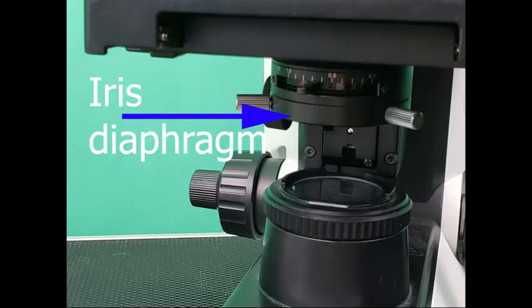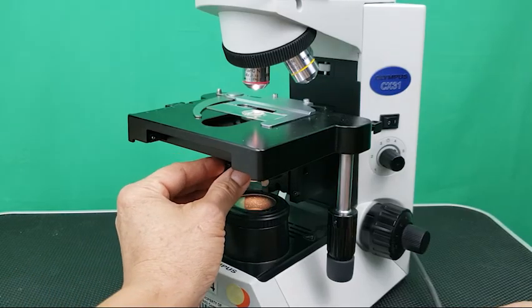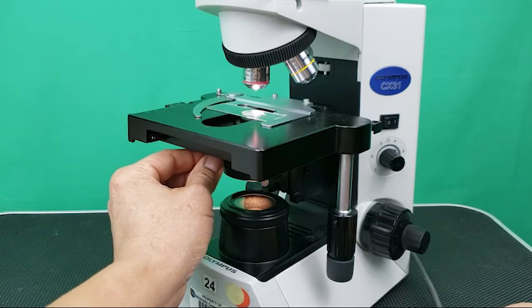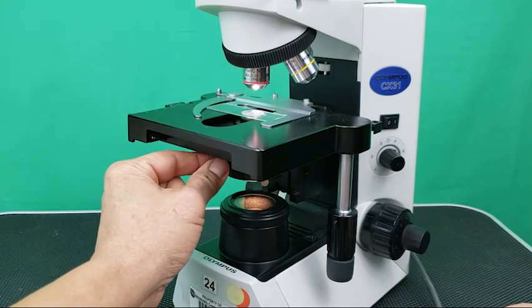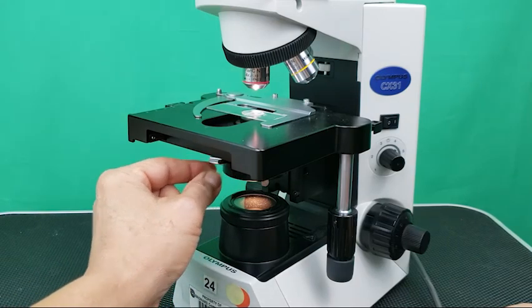Iris diaphragm: Located under the condenser, this regulates the amount of light passing through the specimen. Iris diaphragm lever: A lever that opens and closes a ring of metal shutters of the iris diaphragm.